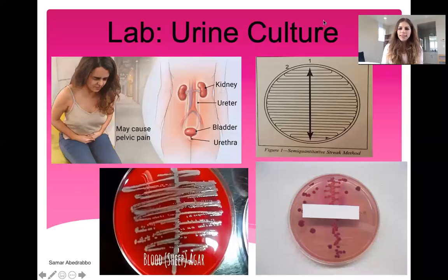Hi everyone, this is the Urine Culture Lab. In this lab, you're going to learn about how clinical hospitals actually diagnose that someone has a urinary tract infection. So what they actually do with urine.